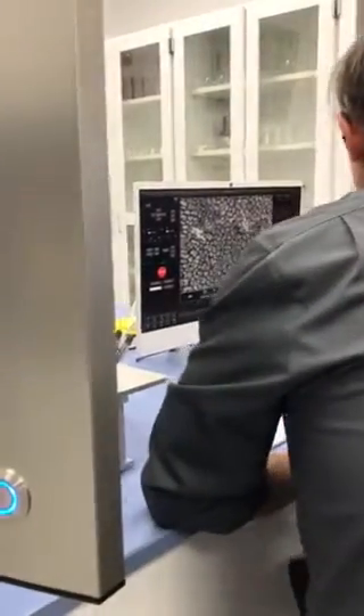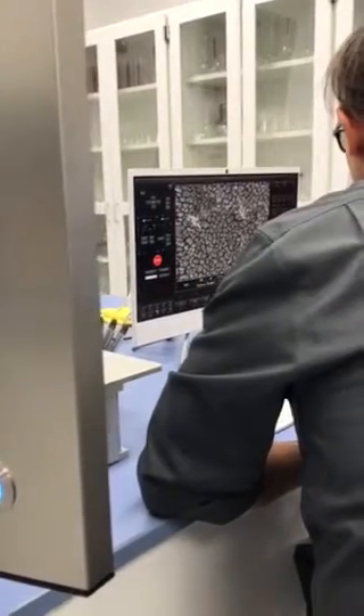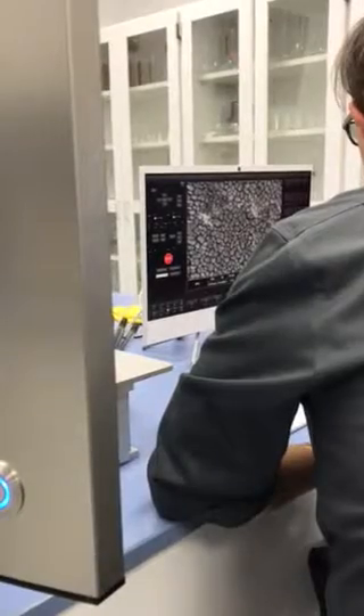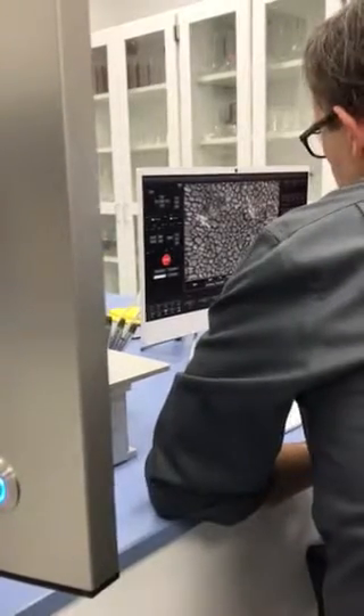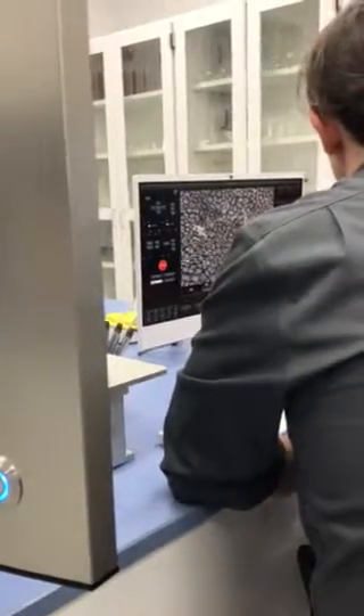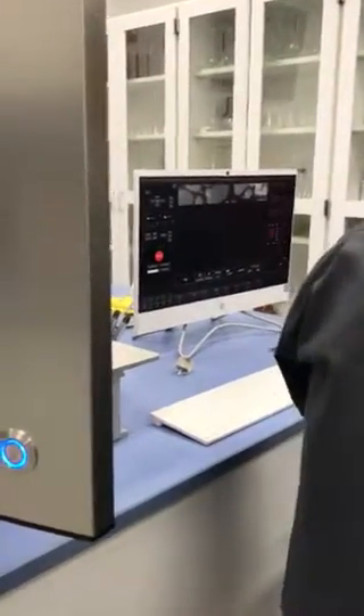As you can see, the speckles look really nice, and we can actually measure these if we wanted to — measure how big a particle is, or what the spacing is between particles. Let me come back out and increase the magnification. We're looking at around 100,000x right now, and this is already past Dan's SEM by about 30,000x — and this is on a tabletop.